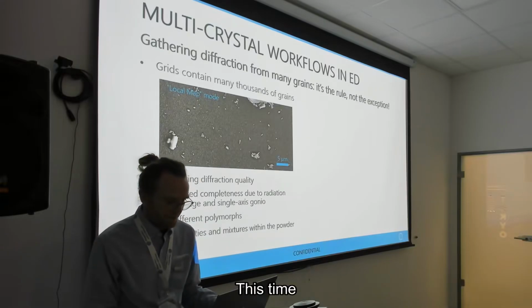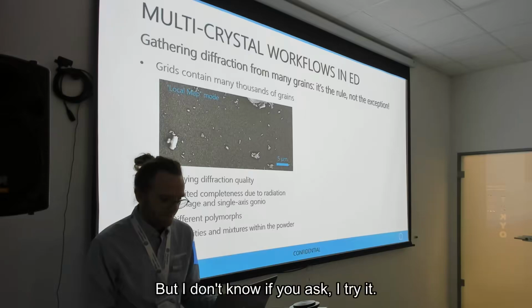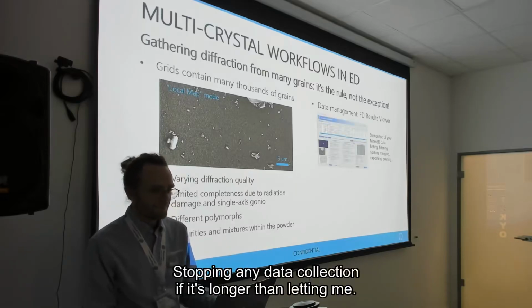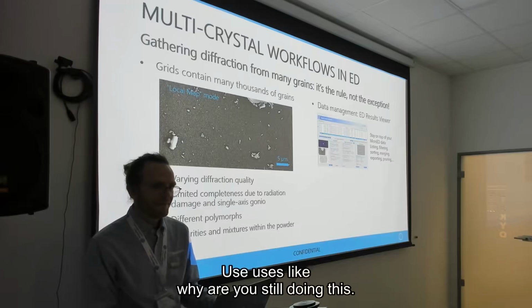Why is it saving lots of time at the end? And it's better to have more data. I know what you asked. I tried it. Does it save time? Stopping an ED data collection takes longer than letting it just finish. Last time the user asked, why are you still doing this? I said, you'll see why, just let it happen.